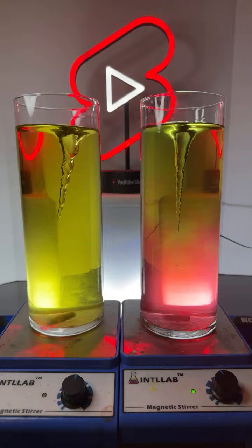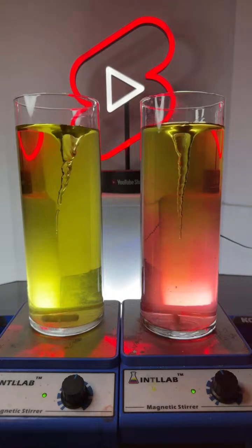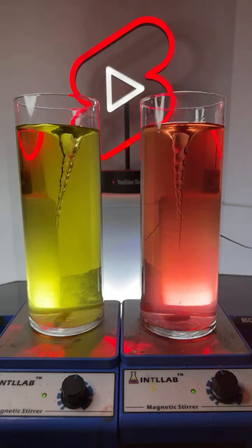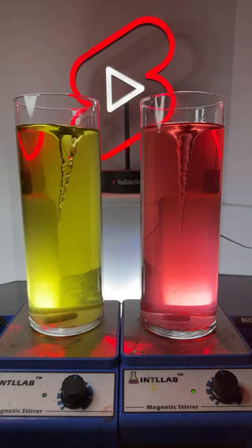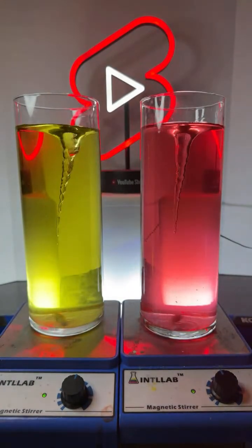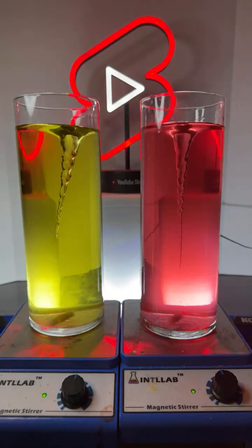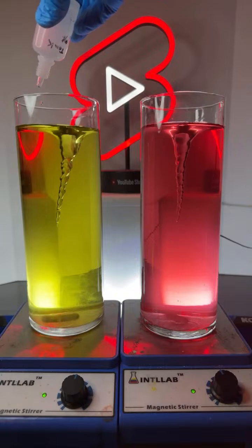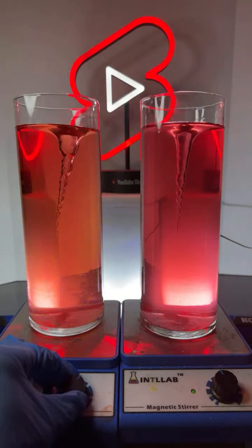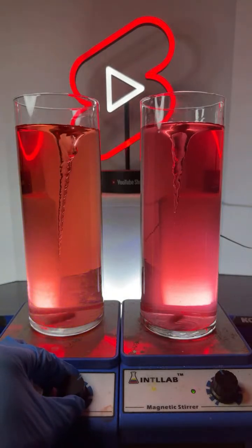Why 3 drops? I don't know why 3 drops. It's just what I'm adding. Looks like our pH is maybe 3 or 4 over there on the right. Yeah. Sure enough. A little bit over here on the left. A little more acid. Let's get the speed turned up here a little bit, huh? There we go.